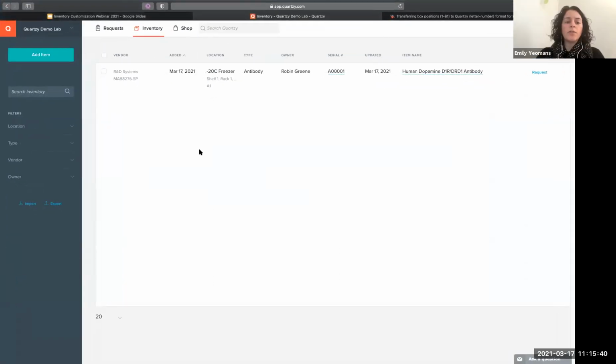Julie is saying it would make a lot more sense if the system could change to fit the existing structure. It sounds like that's something that, as we do ongoing product development and talk about these features, certainly has come up before, and it's certainly something we'll look into. For sure.